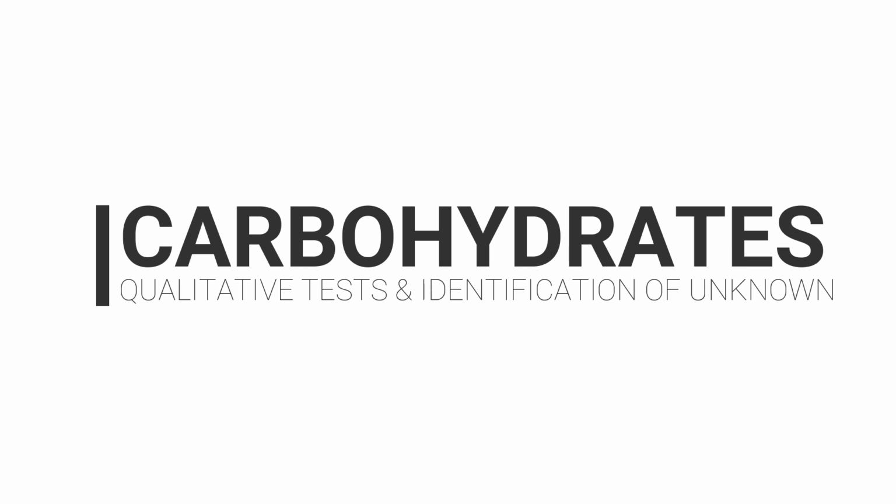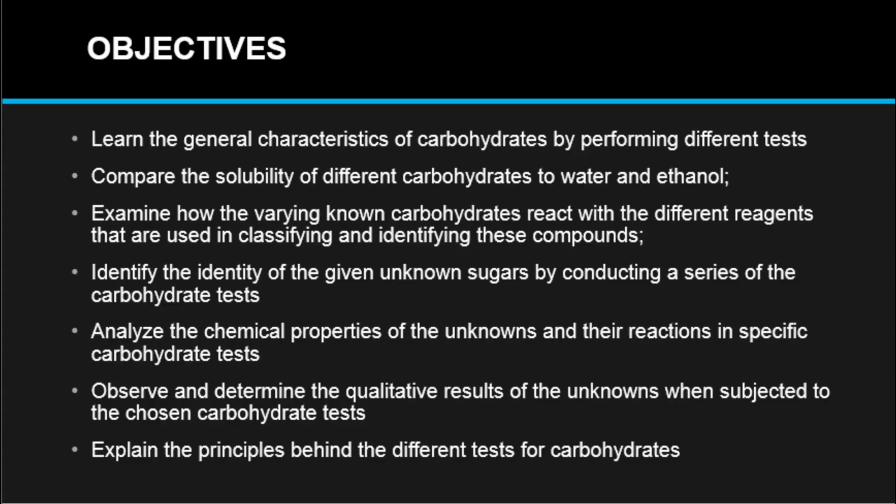So today, we are going to discuss experiments 5 and 6, which comprise the qualitative test for carbohydrates and the identification of the unknown. The objectives for this experiment will be flashed on the screen. Just look at it, read it.